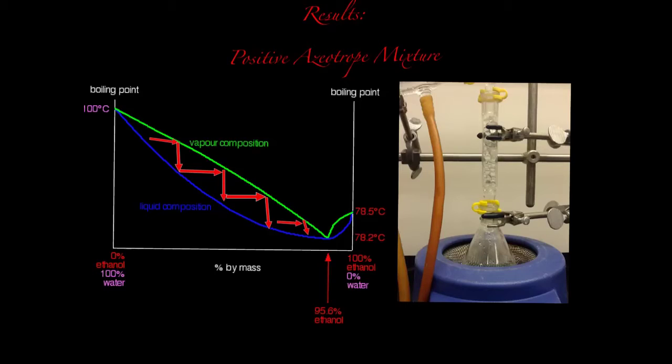This could be attributed to the strong intermolecular attractions between the hydroxyl group in the ethanol and the positive dipole of the water molecules. Both hydrogen bonding, which is a strong type of bonding, and a dipole intermolecular attraction contribute to their deviating boiling points. Additionally, both solvents are polar in nature, so we can expect them to mix well and have some degree of attraction.